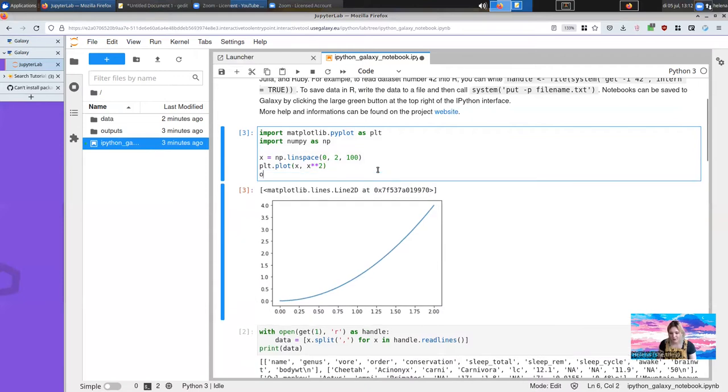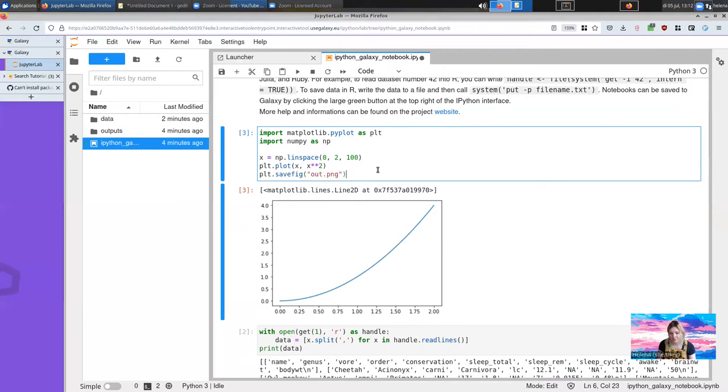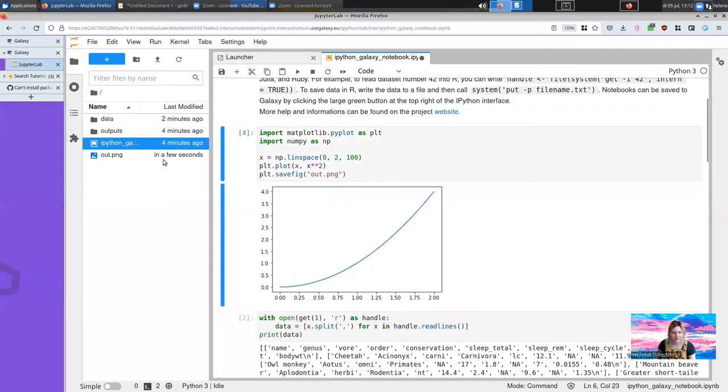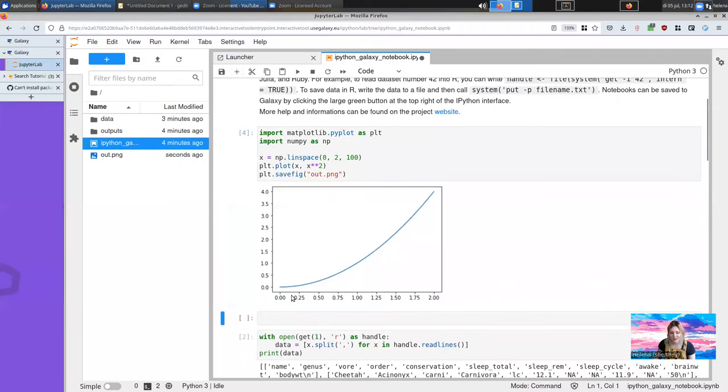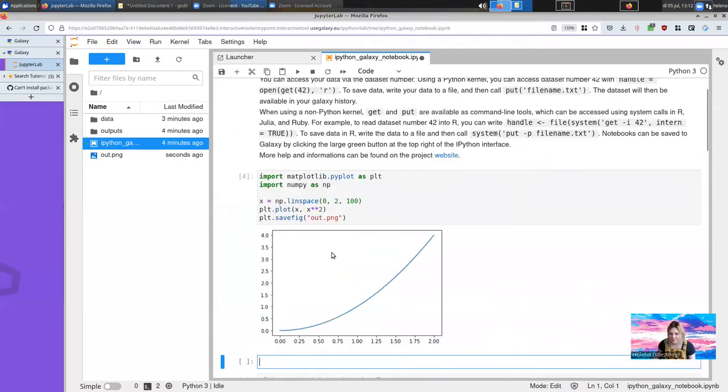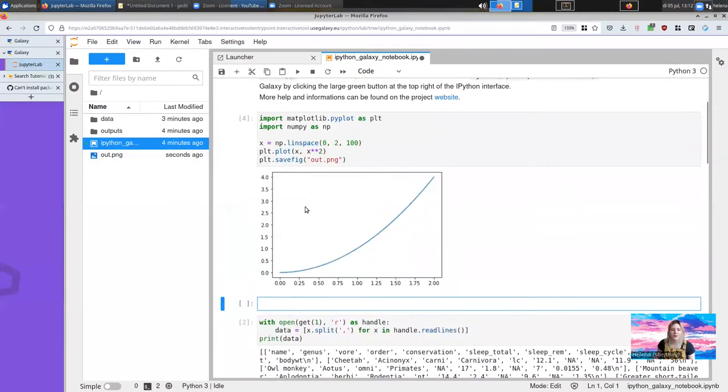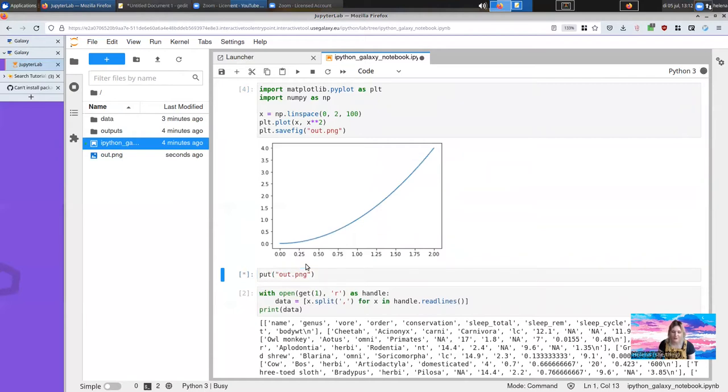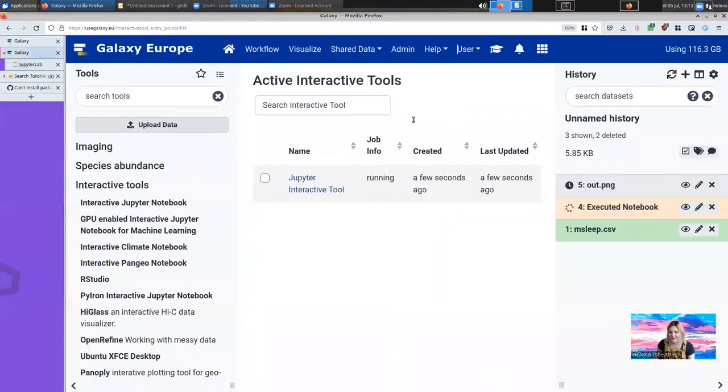I believe we can call plot.save and give it a name. Here it'll save the figure as out.png. Then you can use the put command to share that back to the Galaxy history. So I'll go ahead and run put out.png. Of course, you should use better file names always.